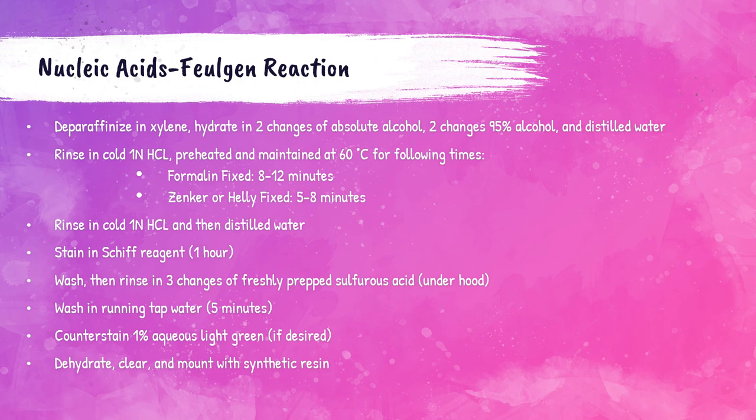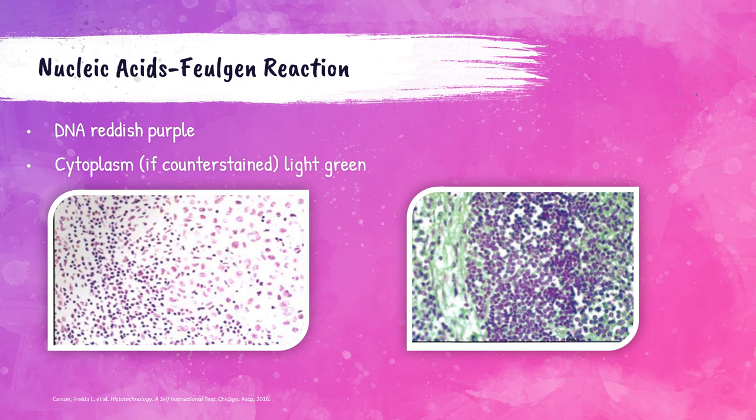If properly stained, the DNA should appear reddish-purple and the cytoplasm, if counterstained, should be light green. The photos shown here demonstrate lymph node sections stained using the Feulgen reaction — the DNA is a bright rose-red. The right photo shows the same stain counterstained with light green, displaying the cytoplasm in light green. These two photos also show possible issues: on the left, under- or over-hydrolysis causes the aldehydes not to be demonstrated with the Schiff reagent; on the right, too much counterstain is applied and the section is cut too thickly.